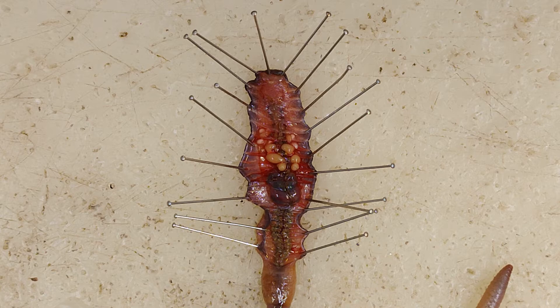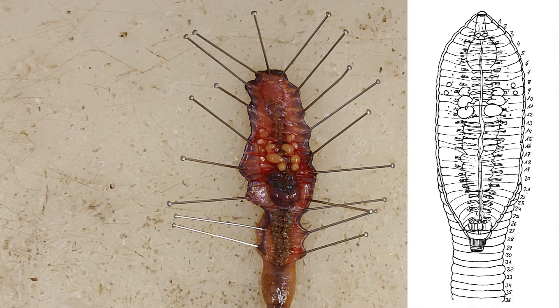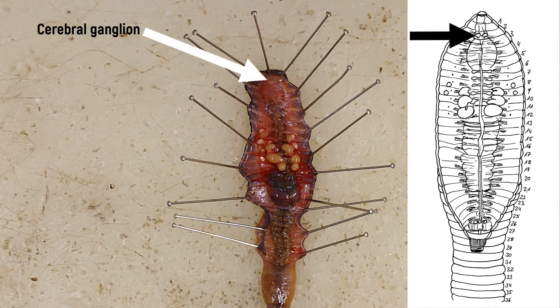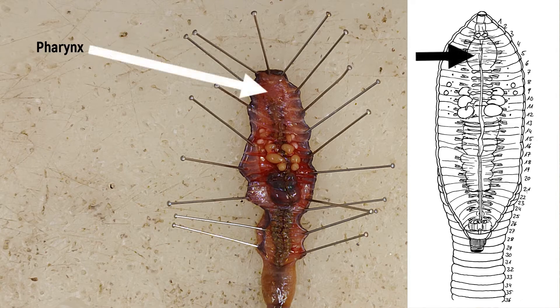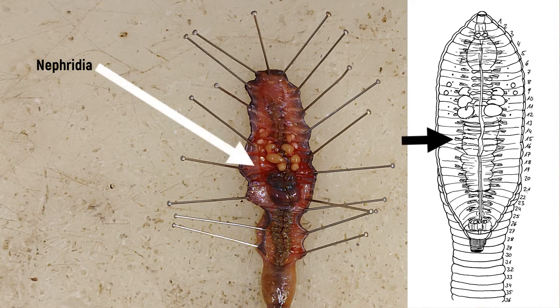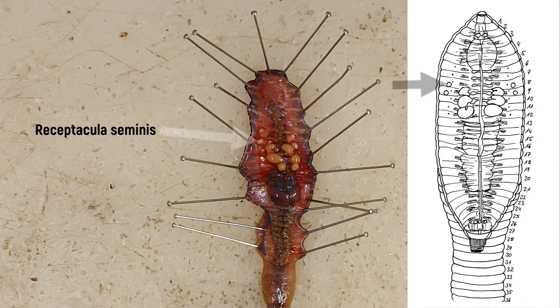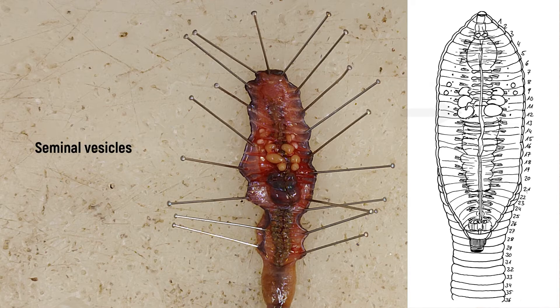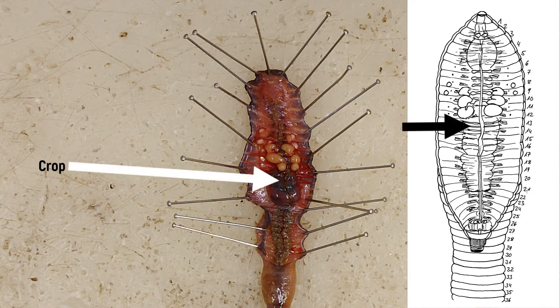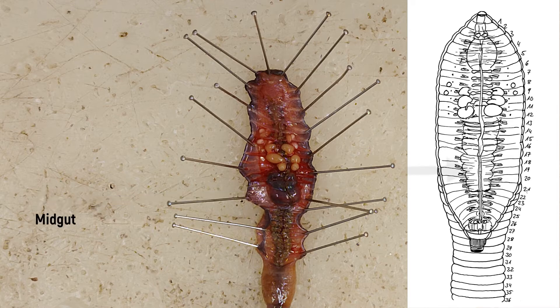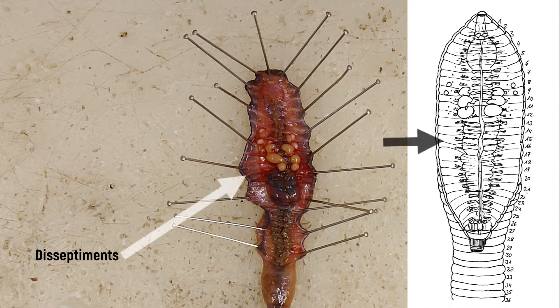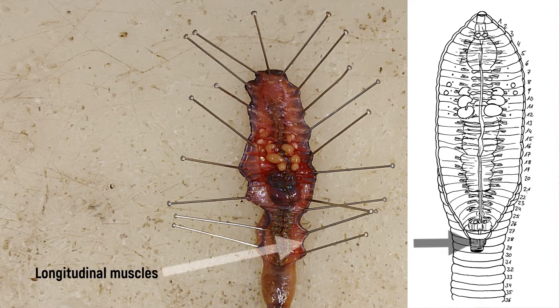The preparation can now be drawn. It is important to ensure that the segments are numbered correctly, as some of the organs are only in certain segments. It is essential to recognise the suprapharyngeal ganglion or brain, the pharynx, the nephridia, the lateral hearts, the esophagus, the four seminal receptacles, the six seminal vesicles, the crop, the gizzard, the midgut, the dissepiments, and the longitudinal and circular muscles.